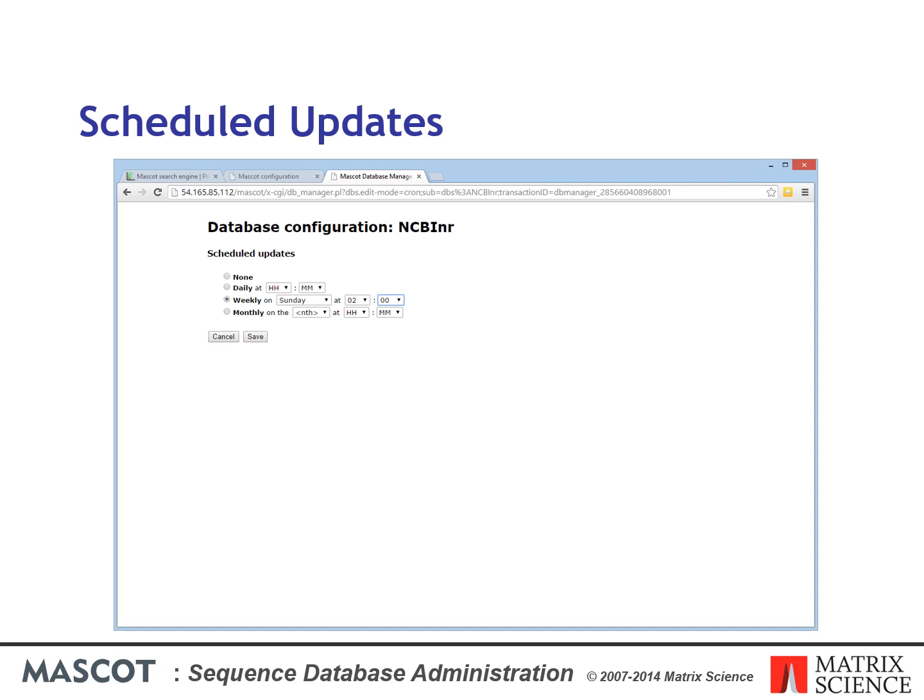It is usually best to download the files at a quiet time, like the middle of the night or at the weekend. Note that keeping the definition up to date and keeping the database files up to date are 2 different things. A predefined database definition is kept up to date automatically, while a custom database definition is not.